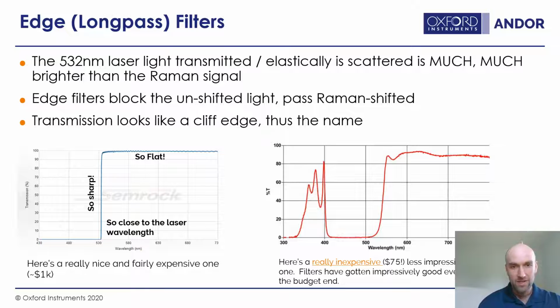And here's a less expensive one, but still pretty good. I mean, $75, what can you get for that? So you can see it's a little bit less sharp of an edge, a little bit of ringing here, maybe not quite as close. I really had to dig around to find one that looked this good, it didn't look quite as nice. But even then, for $75, come on, that's amazing. Filters have gotten impressively good, even on the budget end.